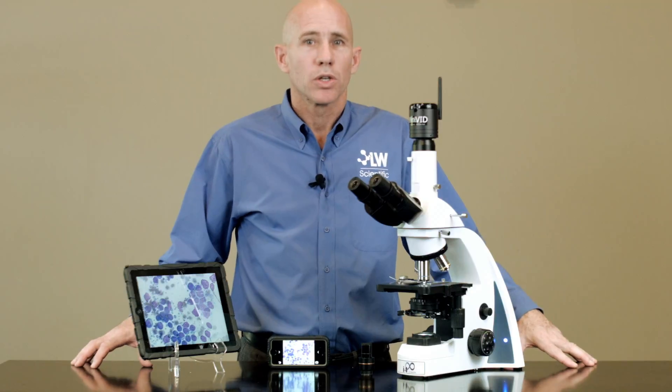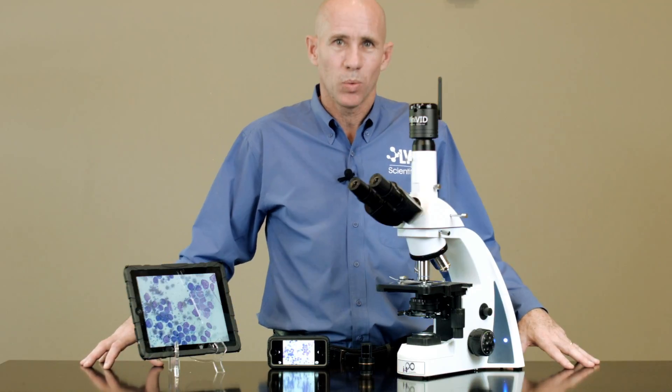Capture high-resolution images and smooth video clips to create histories in client records and to train your technicians or students. The Minivid Wi-Fi camera will give you the competitive edge in this increasingly digital world.